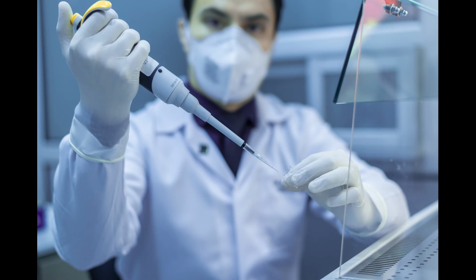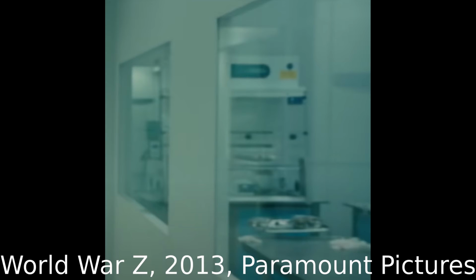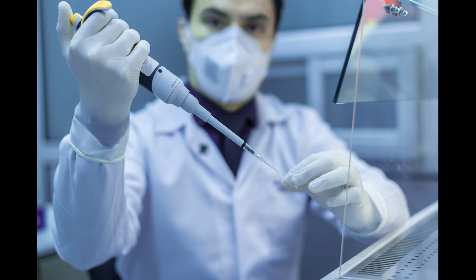Where Biosafety Level 1 only required that a door separate the laboratory from anywhere else, Biosafety Level 2 goes up a level again as well. And in this case, the doors must be self-closing. There must be a sink and eye wash facility readily available. This is important in the case of, say, a contaminant or pathogen getting into your eyes through a splash or aerosol.